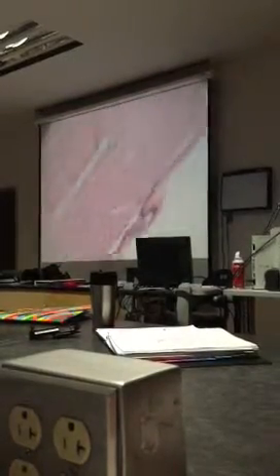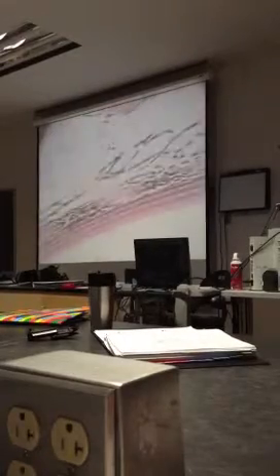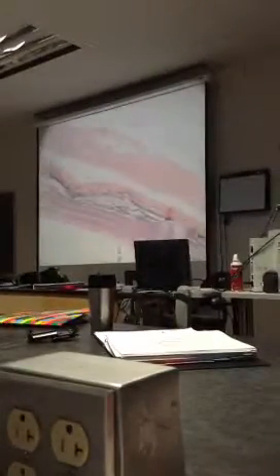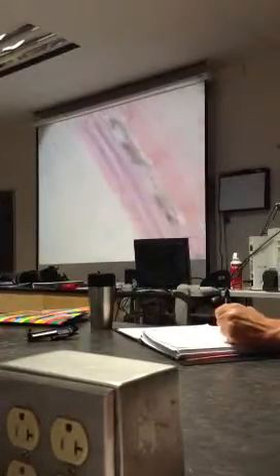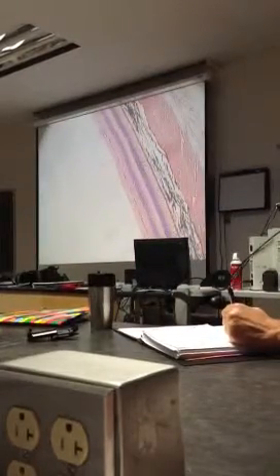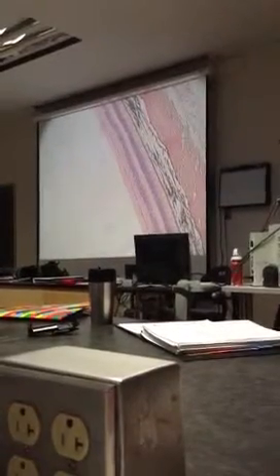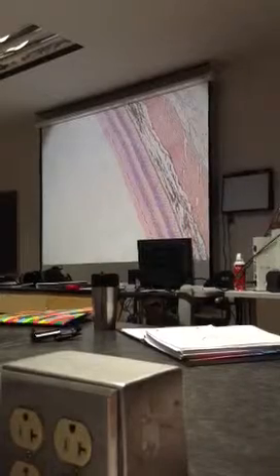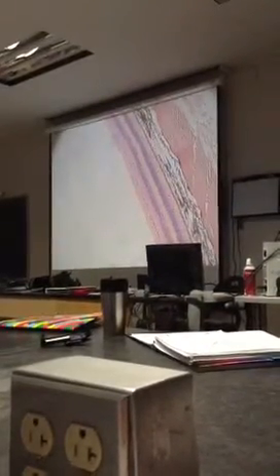We continue back from the ciliary body, still part of that middle vascular tunic, and you can see it starts to become — what is it called back here? The choroid. So the iris turns into the ciliary body, which turns into the choroid. I'm looking for a decent section that's not totally falling apart — there's some artifact right there, like lines of dye or something. These slides are not as expensive and perfect as what you see in your book. So what's this main layer? The choroid — because vascular tunic also includes the iris and ciliary body, so the most specific answer is the choroid.